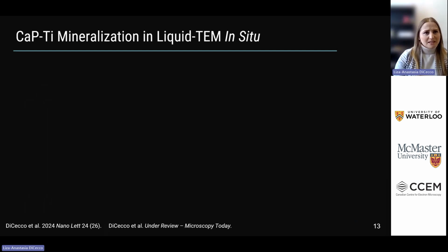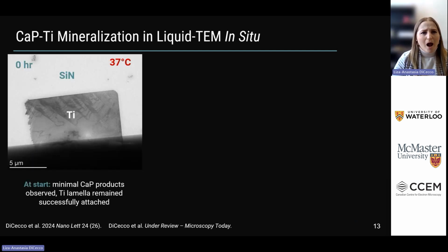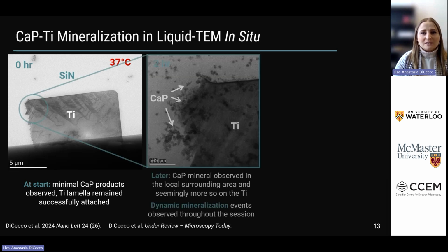So what did we see? Let's dive into a little bit of the results before closing down. So at the start, this is kind of what we looked like, and anyone who does FIB work knows anything could go wrong, and we're really happy to see the FIB lamella, the titanium still remained attached and didn't detach at any point during these processes.